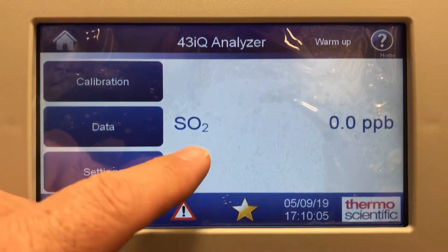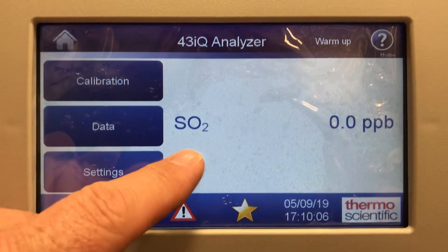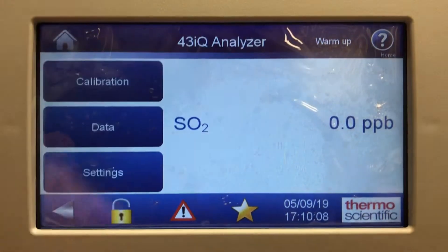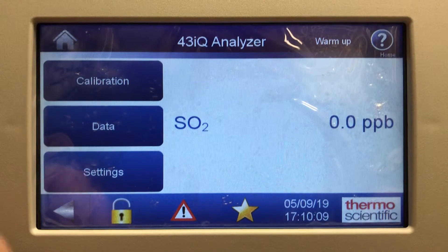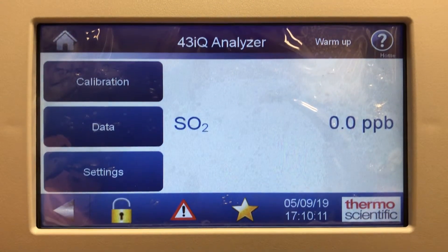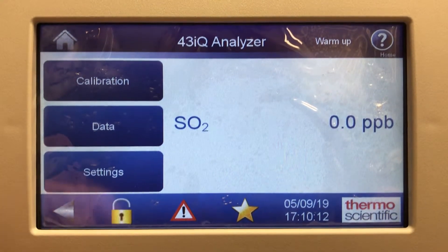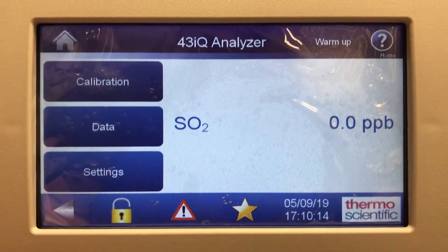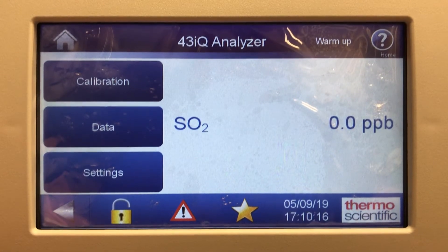That's the SO2 analyzer menu overview. It's still in warmup mode since I just turned this on not long ago. If you have any questions, feel free to comment and we'll talk to you again soon. Thank you.